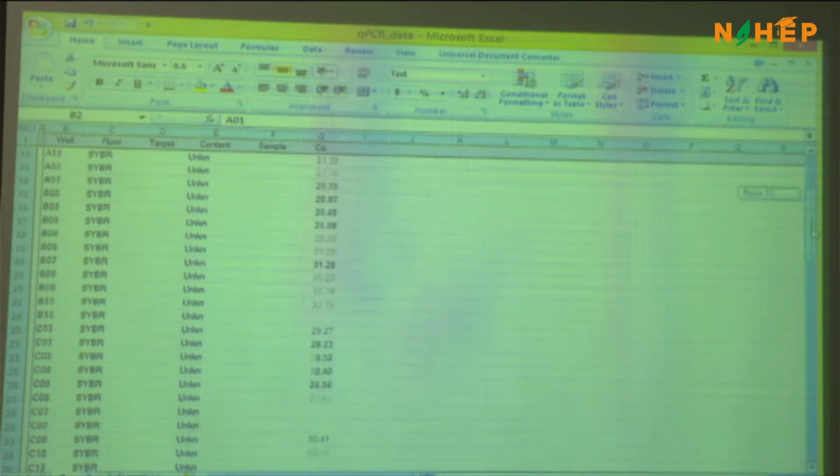How do I fill the gap? That's why I didn't calculate it. In this well, this is the condition I have provided, and according to time points, you can do the editing. If we didn't do that, I have to go back to my normal data, which I have, because I provided the cDNA from my sample. I have to go back to my data, label the wells, and then do the analysis.